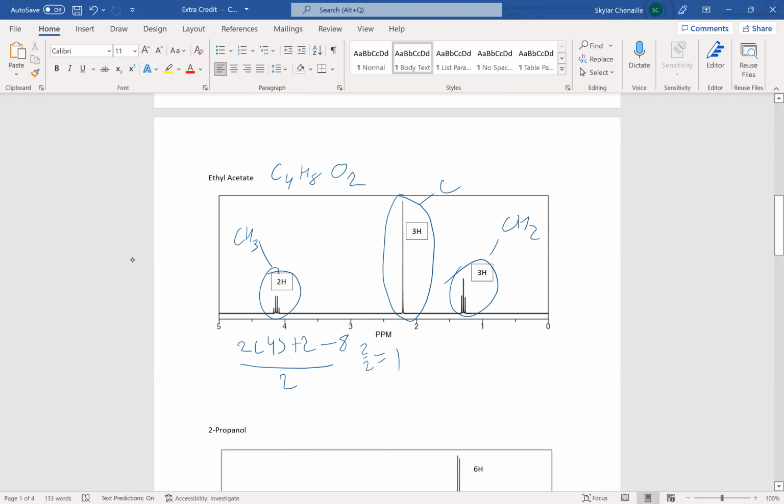So let's brainstorm an idea here. So if we want to connect these carbons, so we'll do a carbon to a carbon. Likely we'll have 1 over here with our H's, right? So we get our triplet group over here. And the other thing we need to look at is a little bit of the integration.